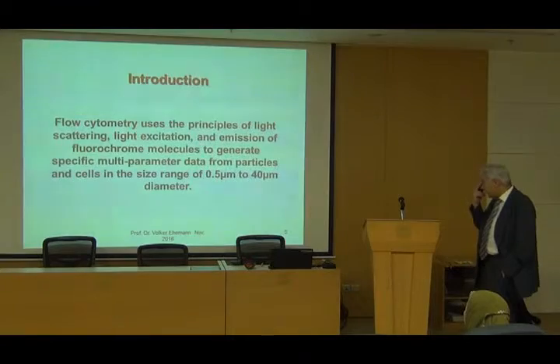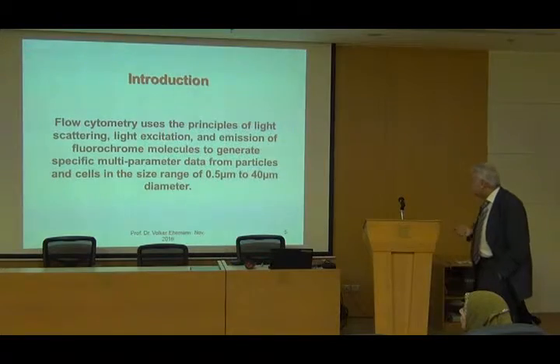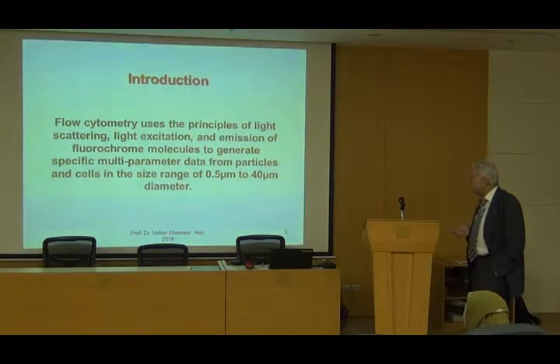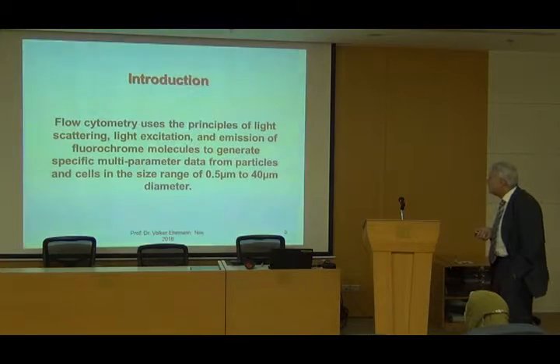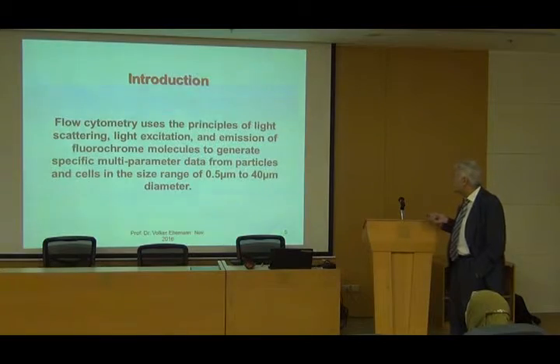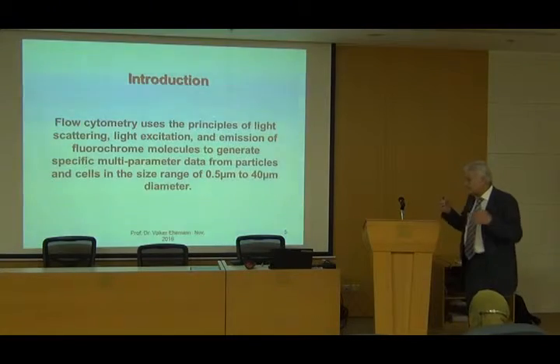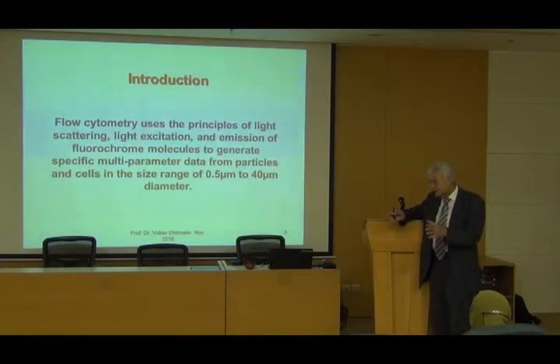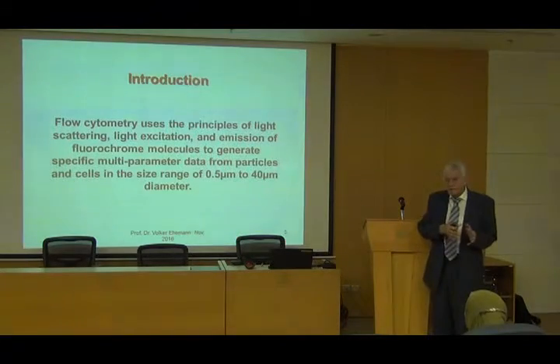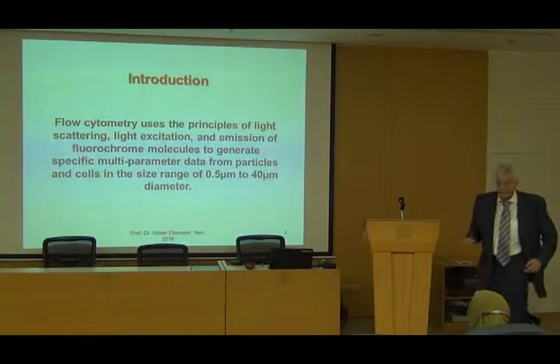It uses the principle of light scattering, light excitation, and emission of fluorochrome molecules to generate specific multi-parameter data from particles and cells in the size range of 0.5 micrometer up to 40 micrometers in diameter. That means you can detect everything from large cells down to yeast.